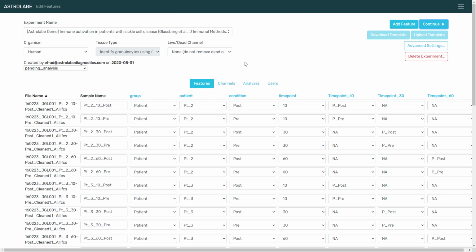And please join me in the next tutorial where I'm actually going to skip the actual analysis. It's going to take about an hour for the platform to crunch through all this data, and within an hour you can access the results. And please join me in the next tutorial on how to analyze the results of the analysis and how to go through the different visualization and figures that Astrolabe offers.